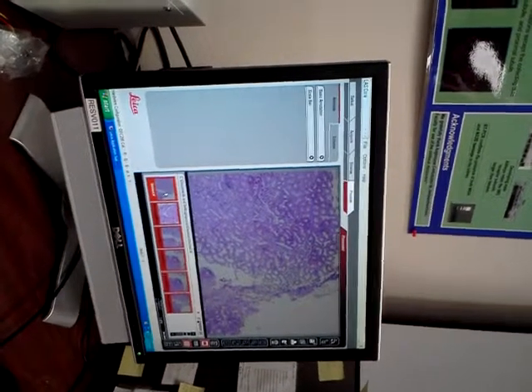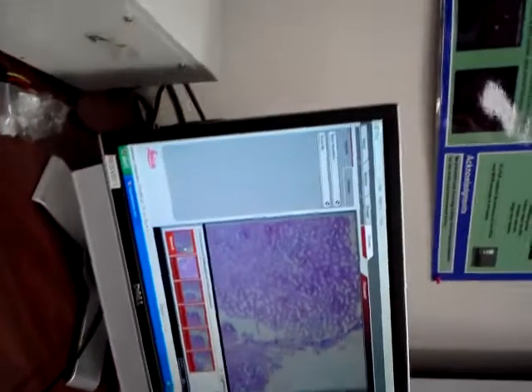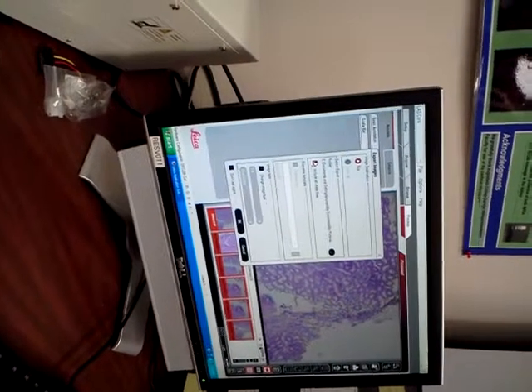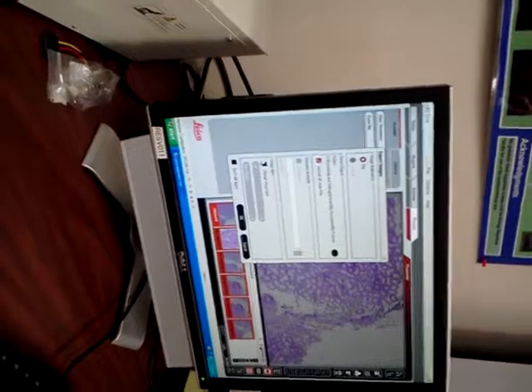I mean, I can just go to the file that I saved them in, and they're all TIFFs. Yes, okay. Or you can just copy them. Export, send to, copy. Include all meta files. But those are the actual files, so if I just copy and paste them someplace, they're the full-on files? Right.